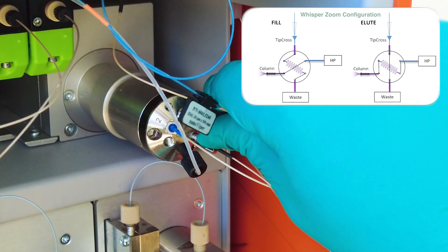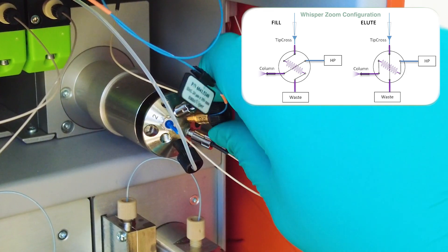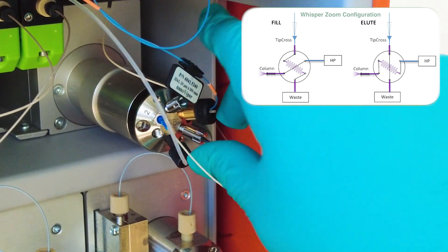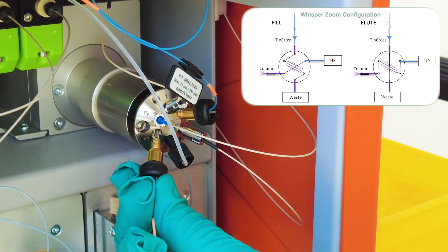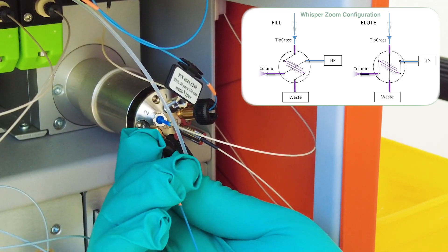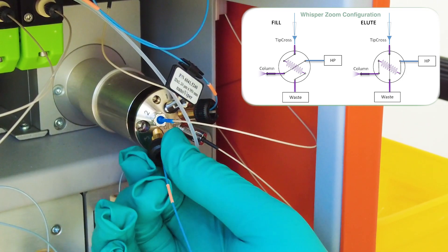Once again, this is all just finger-tight connections. We place that into port three, and this will still be connected to our column.